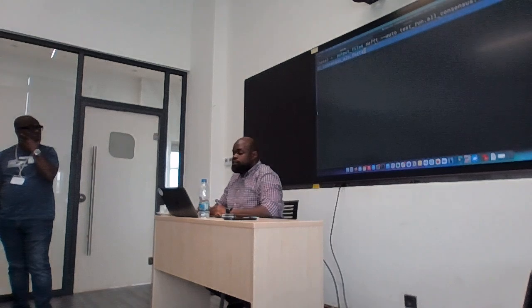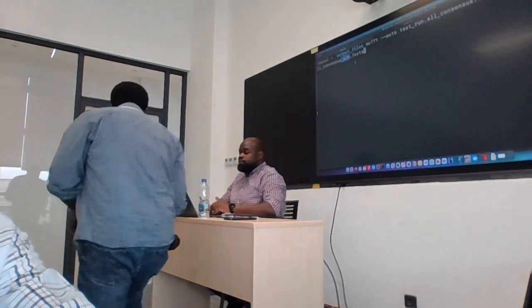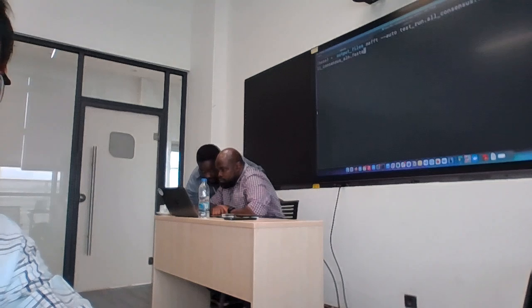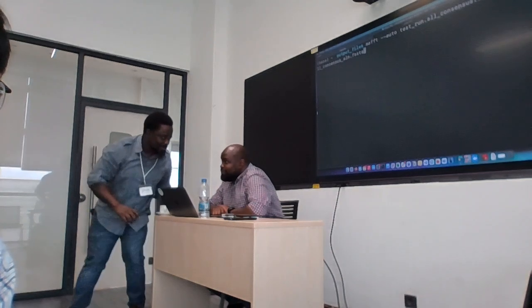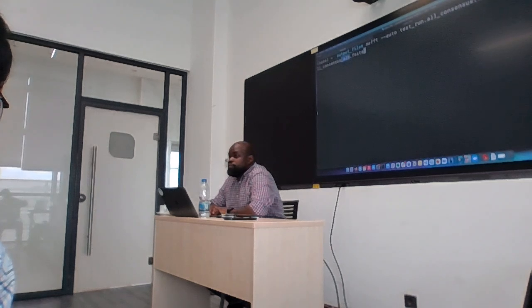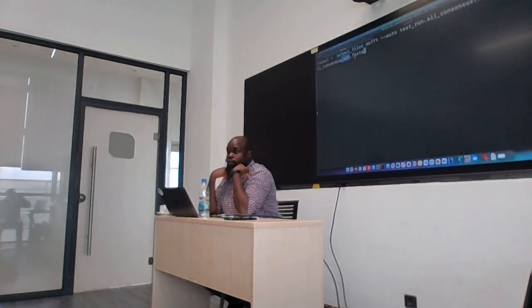So, in my case, I'm using MAFFT, auto, and my file name from Epi2Me is this. I'm calling the output this, you can see I've added this bit to my file name to differentiate it from the original sequence file, so that I will know this one is aligned. Remember, do not give the same name as my file name.